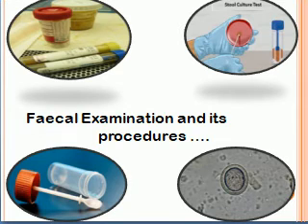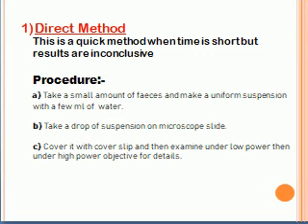Today, I shall be discussing faecal examination and its procedures. There are several methods which can be followed for examination of feces of animals. The first method is the direct method. This is a quick method when time is short, but results are inconclusive.